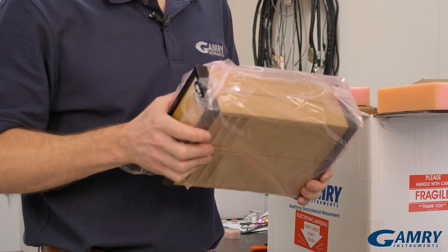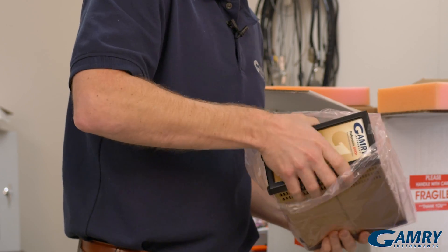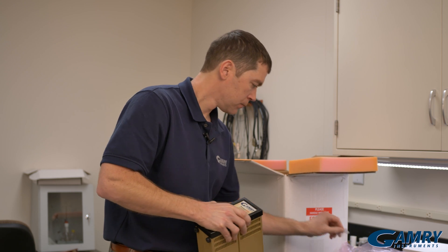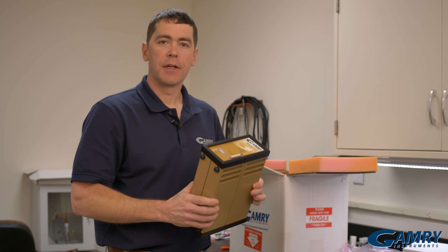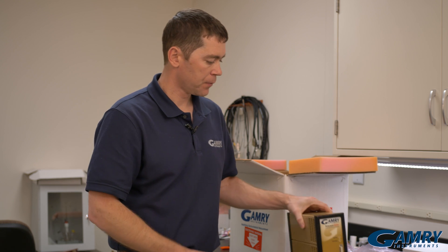Finally, we come across the potentiostat itself, and now we're ready to start the installation process. You would install the software, power your potentiostat on, plug it into your computer, and then go ahead and start calibrating the instrument.